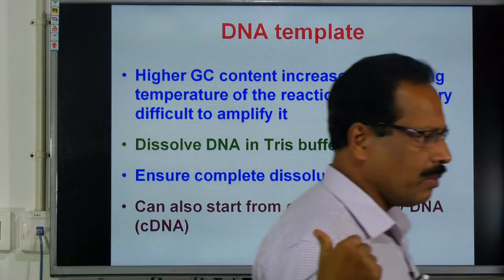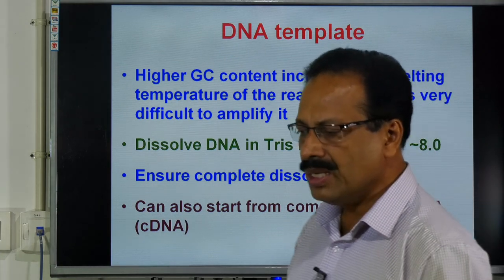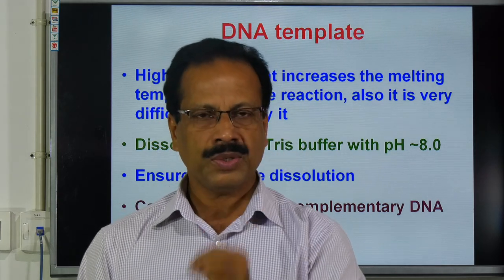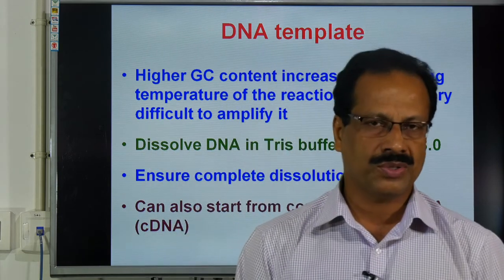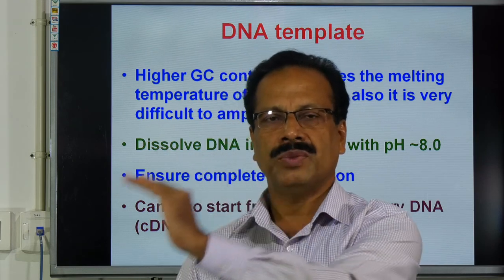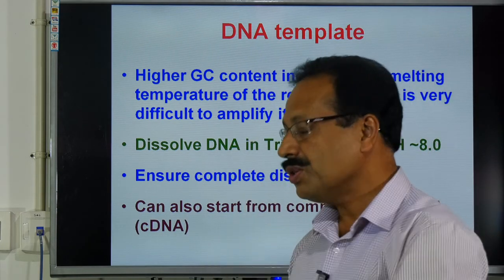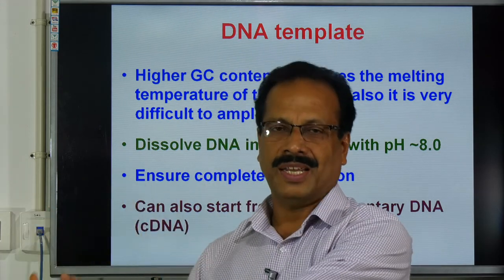And so I was talking about starting the PCR from a DNA template. Sometimes you may need to quantify the expression of certain genes in your cell of interest. Expression of genes starts from the synthesis of mRNA, you know that, messenger RNA is produced. All those genes which are expressed will be converted into mRNA. That mRNA you are taking. If you want to use that mRNA in the PCR machine, you have to convert it into DNA.